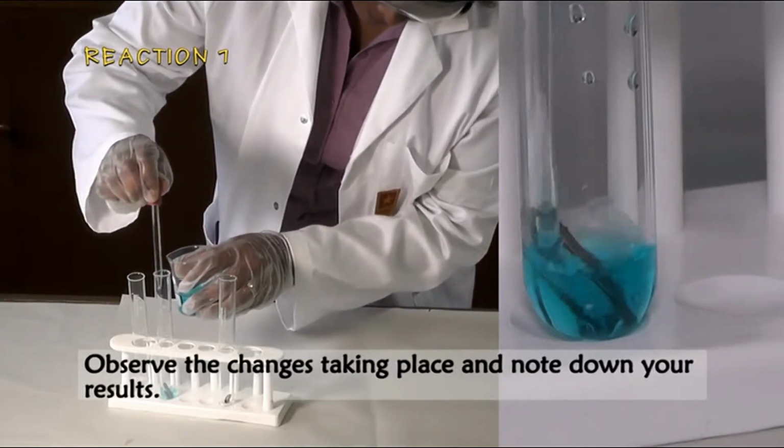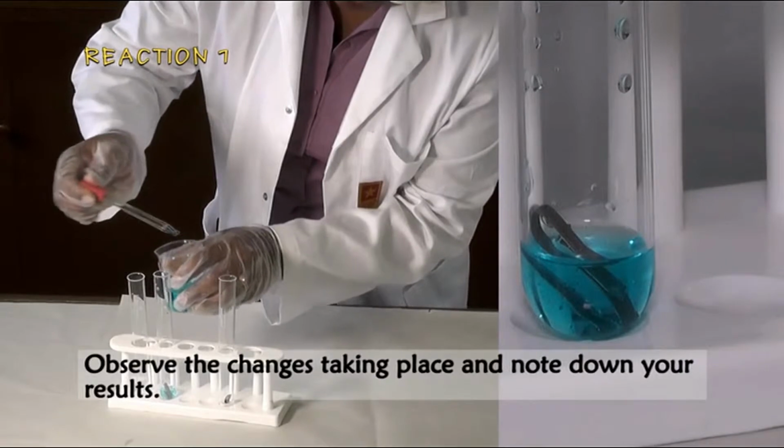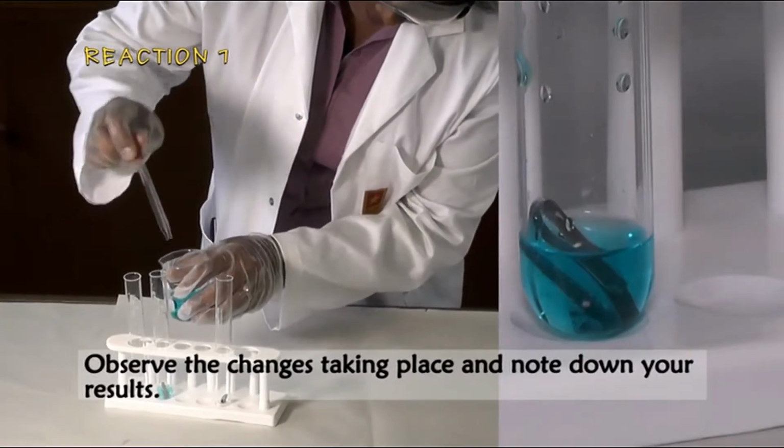Observe the changes taking place and note down your results.